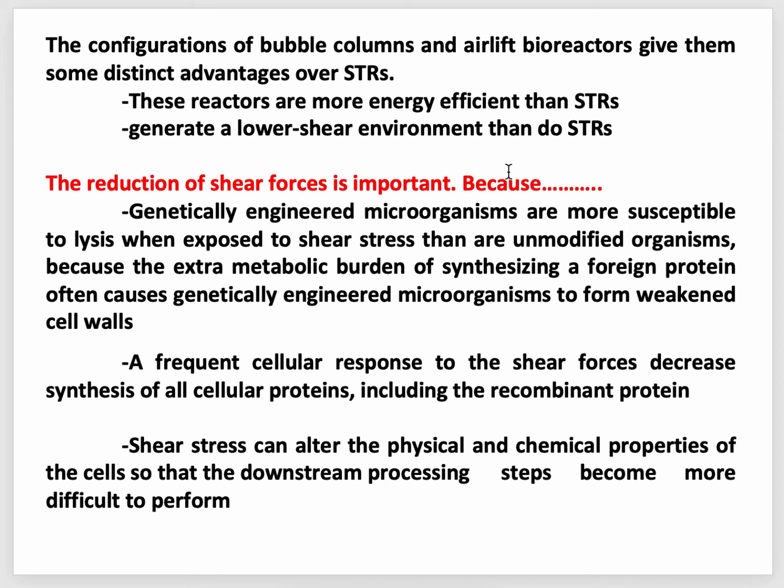Because genetically engineered microorganisms are more susceptible to lysis when exposed to shear stress than are unmodified organisms, because the extra metabolic burden of synthesizing a foreign protein often causes genetically engineered microorganisms to form weakened cell walls.